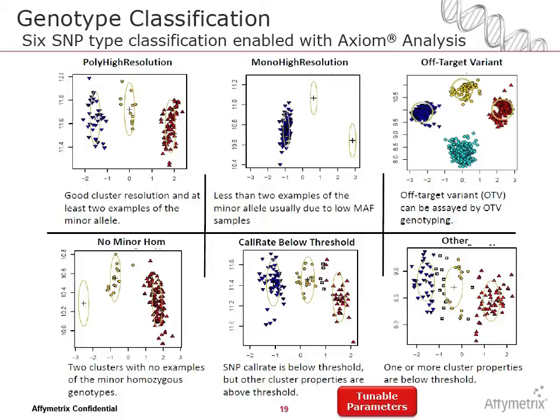It's caused by double deletions or sequence non-homology, where your sample differs from the reference genome. And SNP Polisher software now allows you to pull these samples out separately, so you can analyze the 3 clusters, and then there is this 4th cluster.